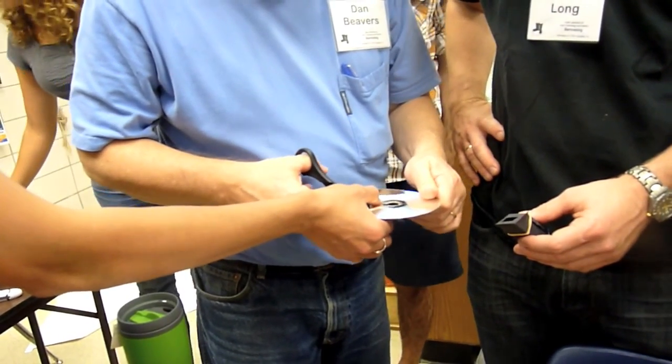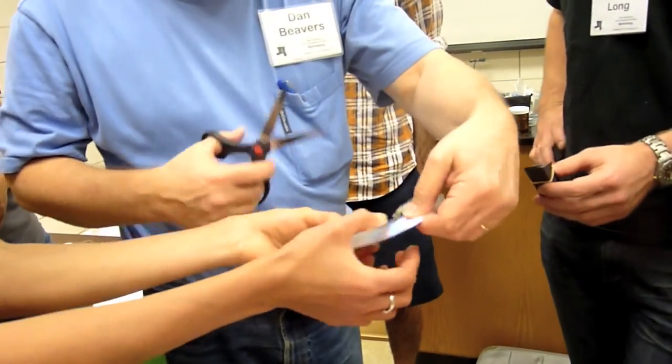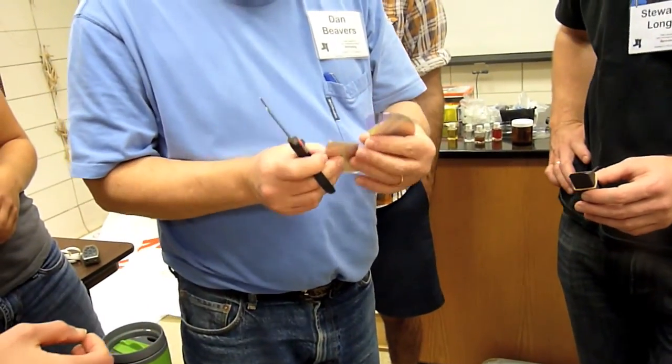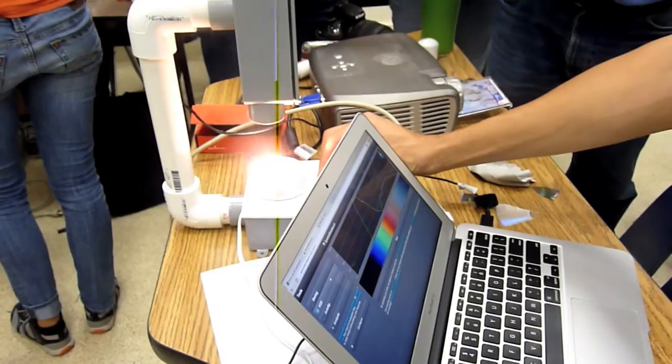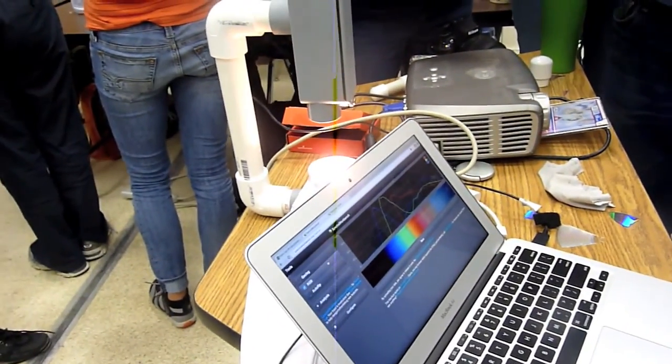Oh, so should I keep this shape? Yeah, that's pretty nice. Your sample too. That's a well exposed one. Yeah. We could turn the brightness down just a tad. So, it's perfect exposure. It's great. It's a great spectrum.